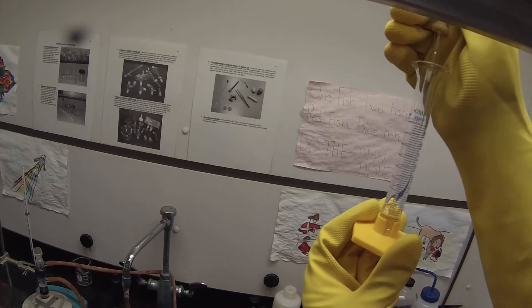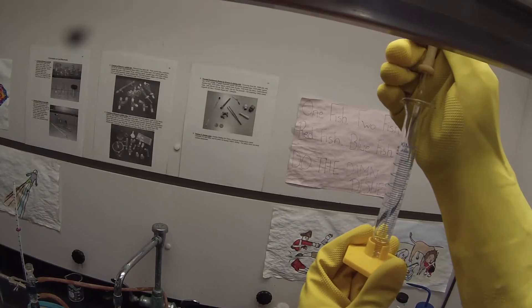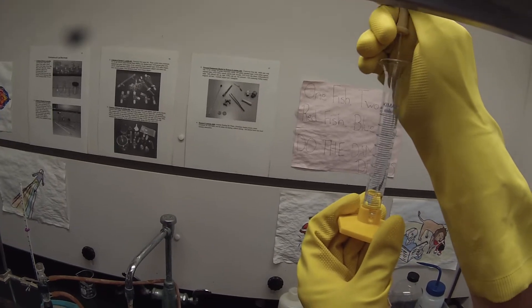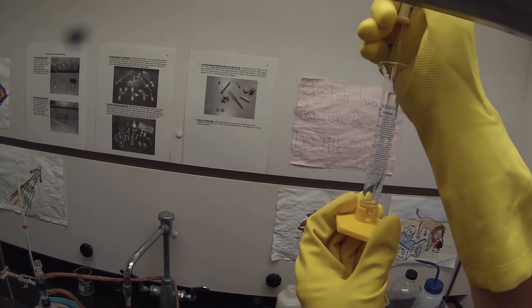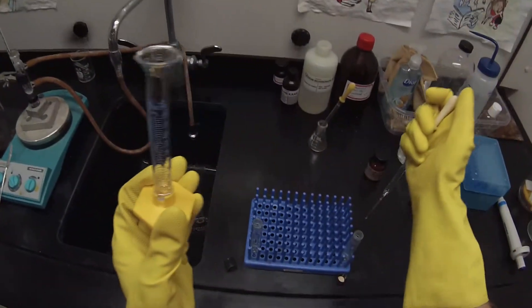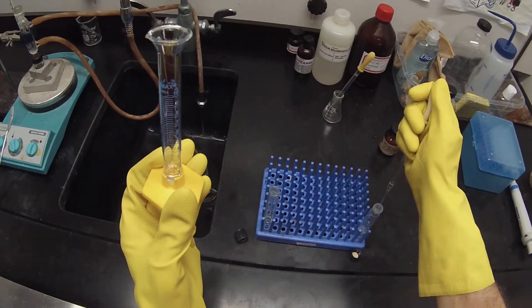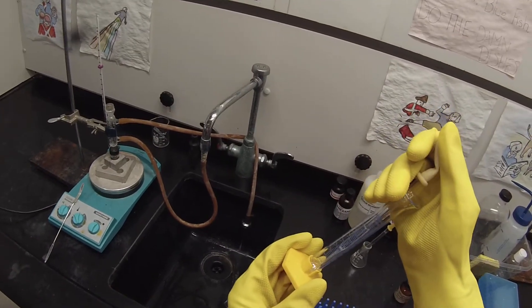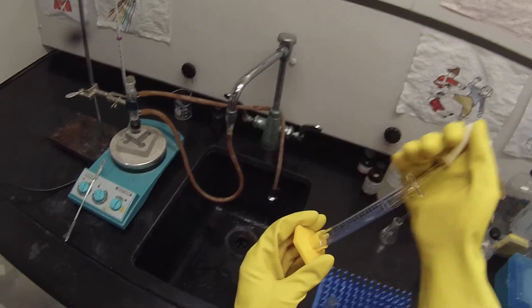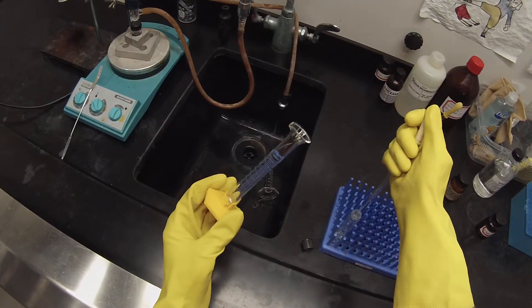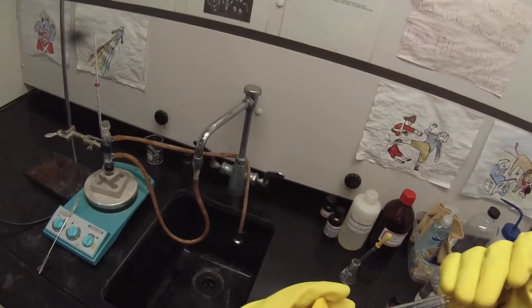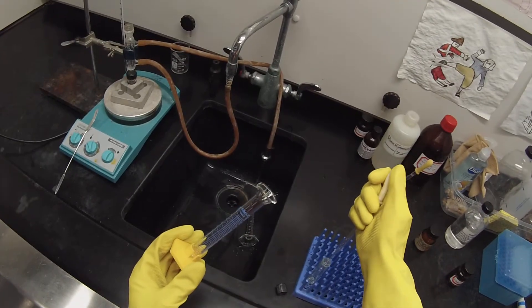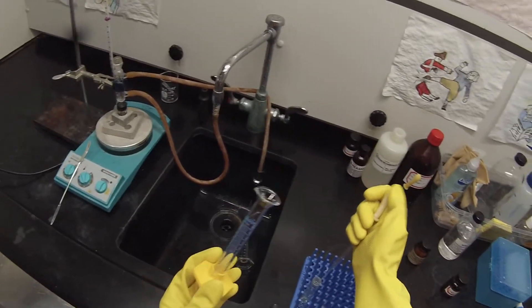And this of course will float on top of that aqueous layer. A milliliter of pentane for that one. And another milliliter of pentane for the other one. So what's going to happen when we set this reaction up by adding the t-butanol is it will react and then the products will immediately go into the pentane layer and thus avoid any further reaction with the acid.